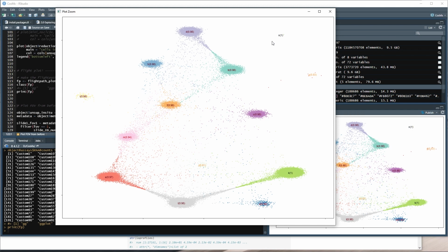We can see that there are some clusters that have very, very few cells assigned to them. So N, maybe 2 cells. There's one behind the label there. Maybe 10, if there are some hiding back behind as well. But there's lower confidence there too. K is 1. We just want high values here, and this looks pretty good.